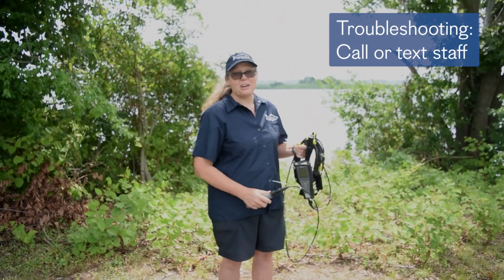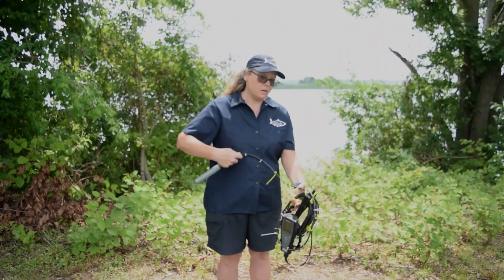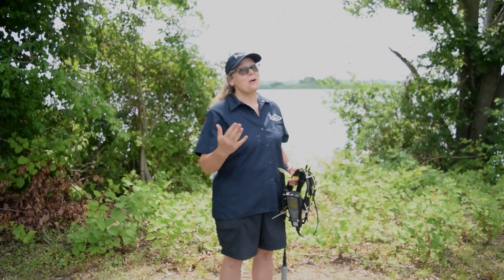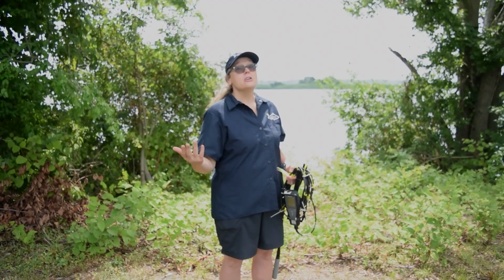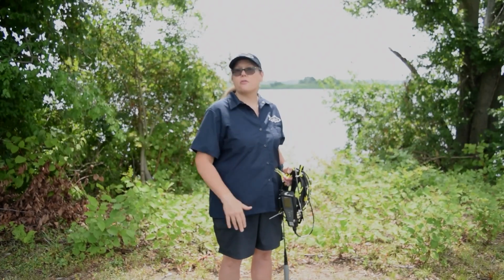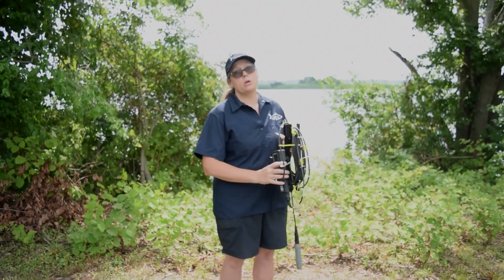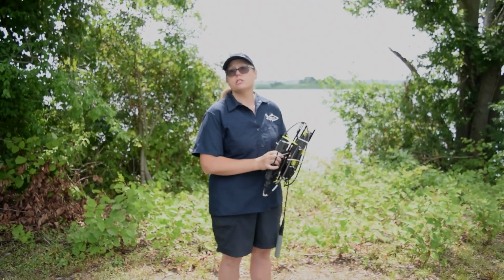If you are still not getting a good calibration, at that point, you need to call or text us so that we can do a meter exchange, and we'll do further troubleshooting in the office while you have a different meter that we know is working that you can use in the field.